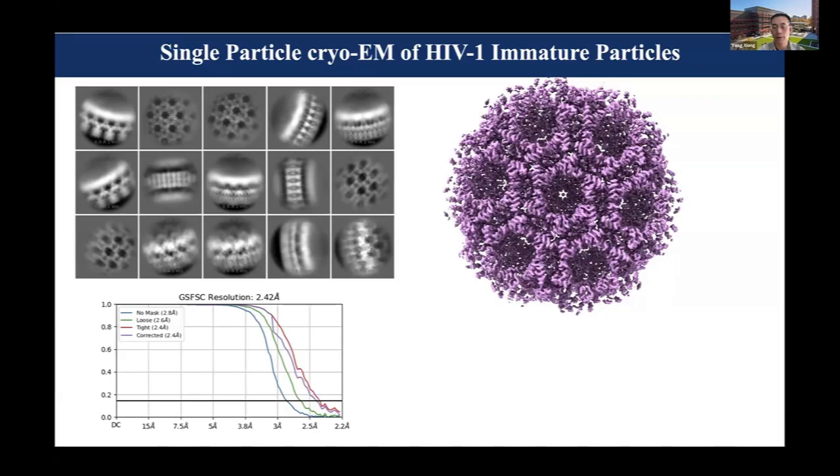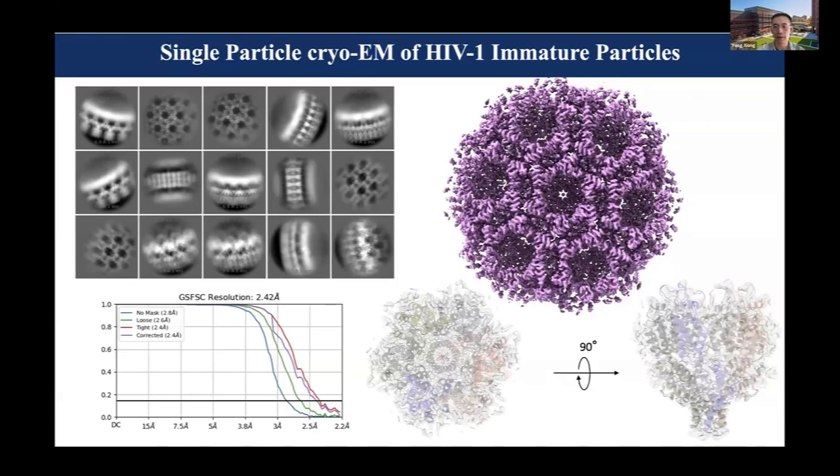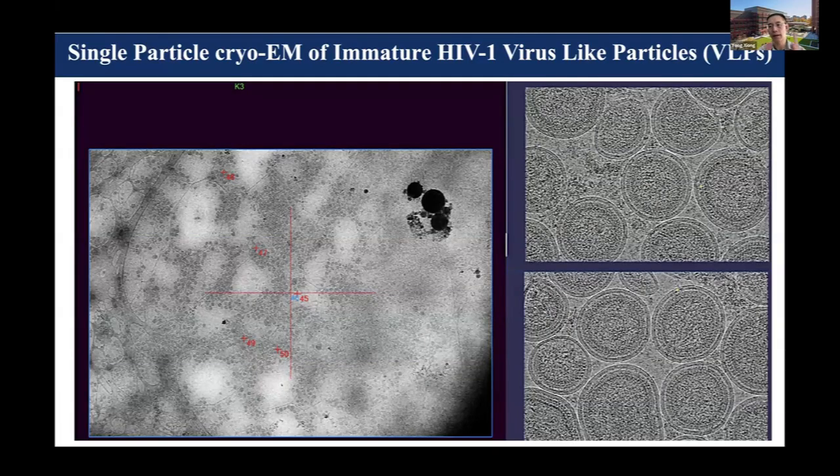Okay, I will introduce you to a few applications of this method. Also, I want to draw your attention to the view I will show you. On the top is a larger region, a patch of the capsid. On the bottom, it's almost like a hexameric building block, in top view and side view. So these are the overall characteristics of the capsid, and we want to study this.